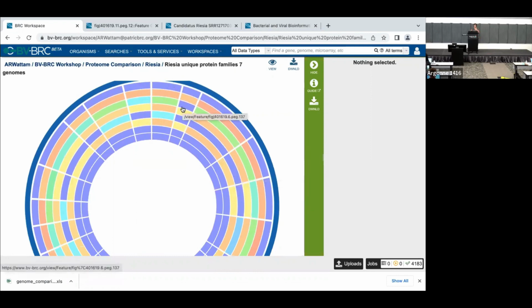I just wanted to let you guys see how you can game this thing to get a visualization that you're interested in, that you might want to include in a paper. And it shows you the data all behind that.